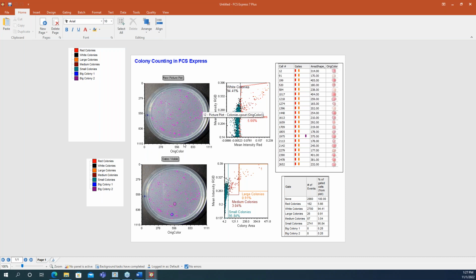So if I was creating something here and I'm looking at my information, so this has been segmented, it has been used by Cell Profiler. I took these images, I started defining different cell populations, and then I can do the same thing I was doing in the previous template, right? I've created these gates already. As I move these gates, you'll see that everything is updating, even that data grid.